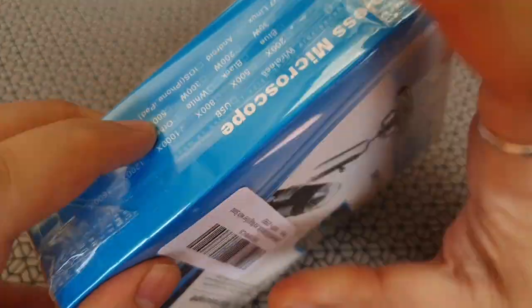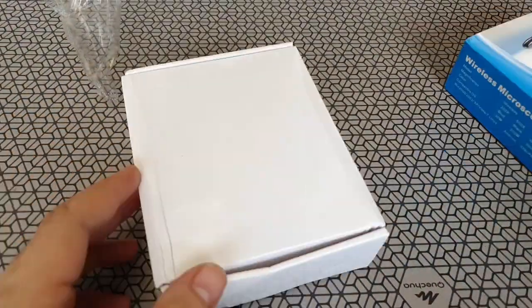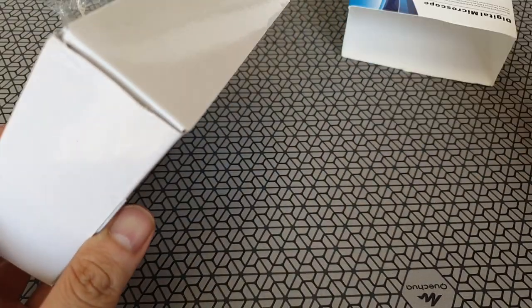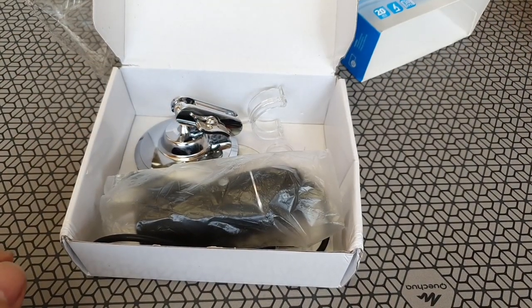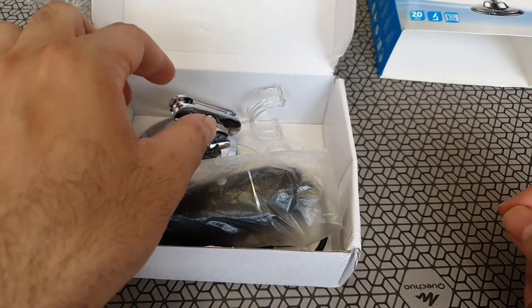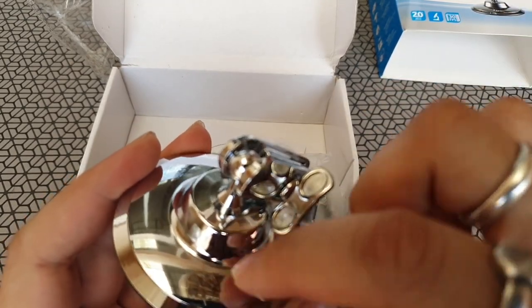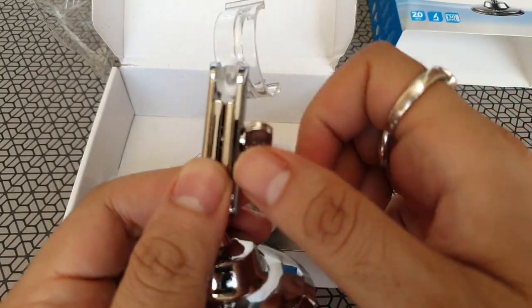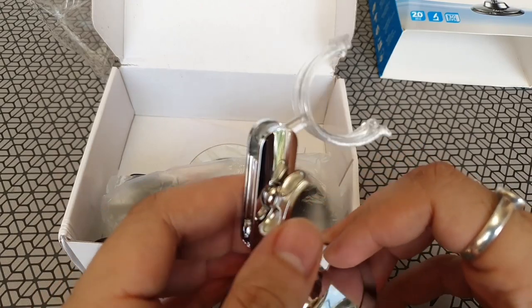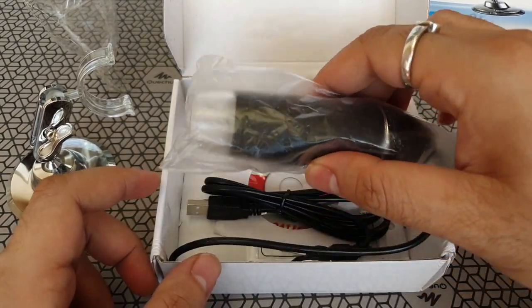Let's go ahead and open this. Inside we have a solid metal stand — once you take out the plastics you can see it's a nice steel stand. I initially thought this was plastic but it's actually metal, probably plated with chrome. It's really heavy and looks good, makes it feel nice and expensive. It's also got a locking mechanism — a very simple stand.